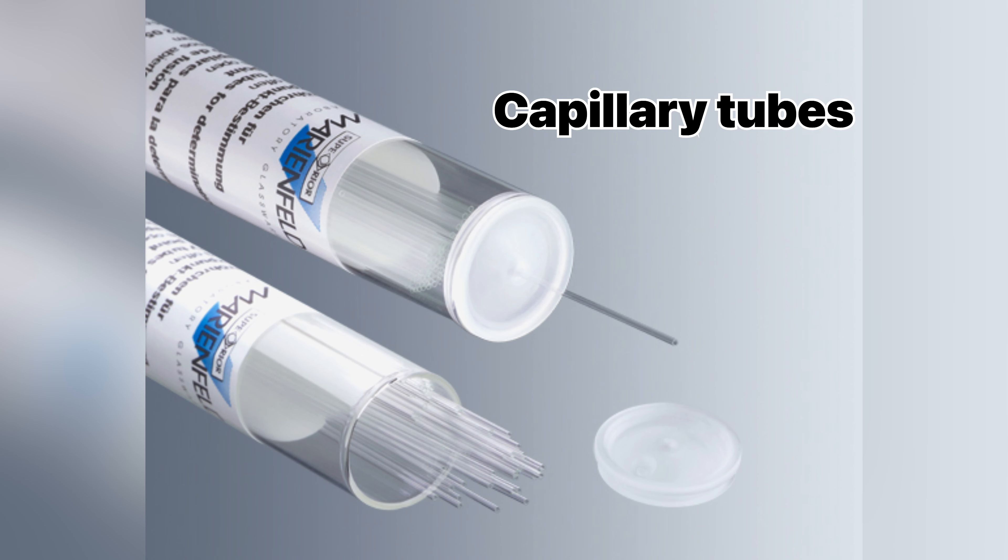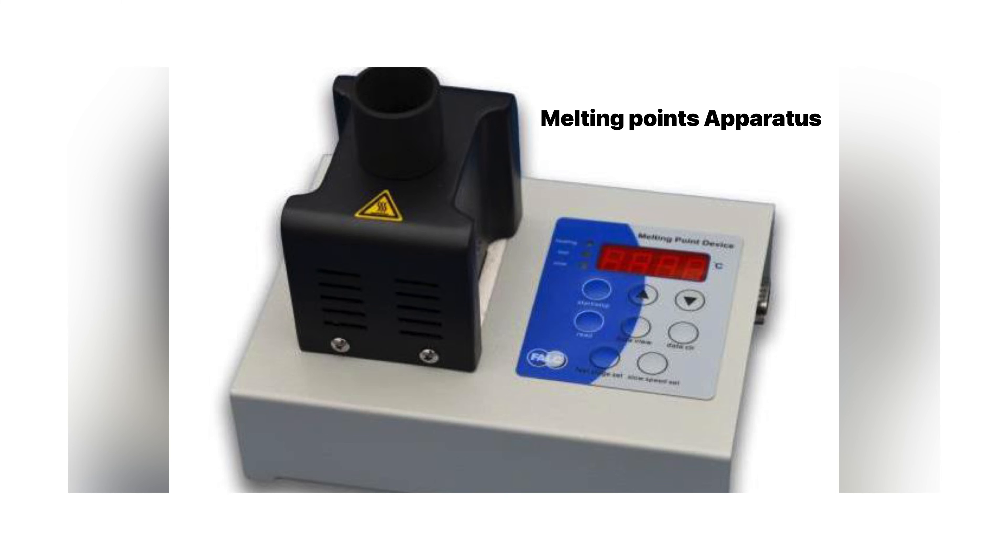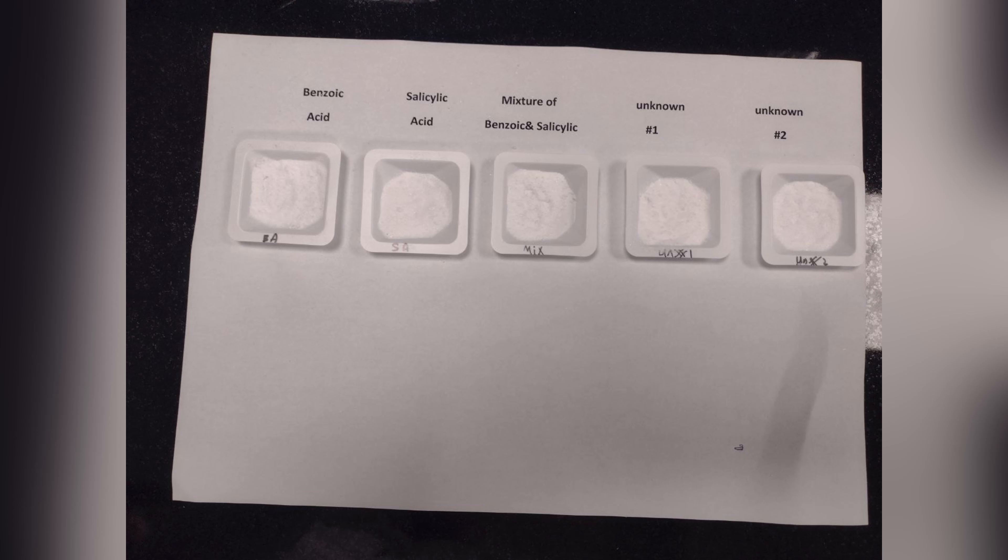Capillary tubes, melting point apparatus, and of course the samples we need to determine their melting points. Starting with benzoic acid, salicylic acid, mixture of both and two unknowns we need to determine their identity.